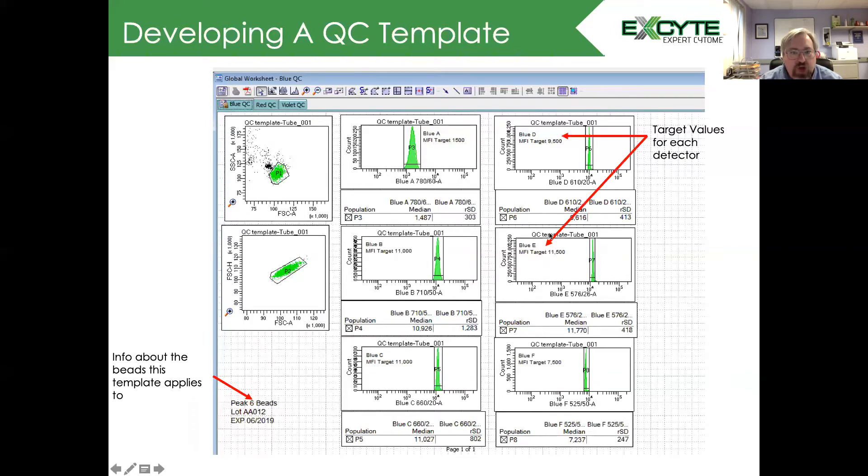You're going to indicate the target values for each of the different values that you're going to be measuring. In this case, we're looking at the median fluorescence intensity of different channels. We've drawn gates around those.